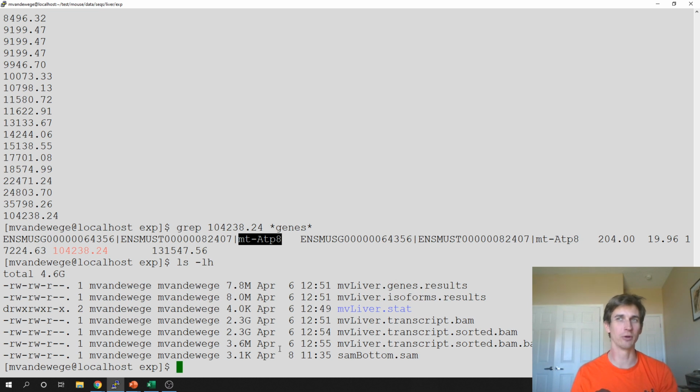But first, the primary tool that does that is R. And we need to get a little bit more comfortable with R before we do a differential gene expression analysis. So we at least need a couple of weeks of practice, 2 or 3 weeks of practice with R before we do that, but we do need to generate this first, and then we'll worry about that later.